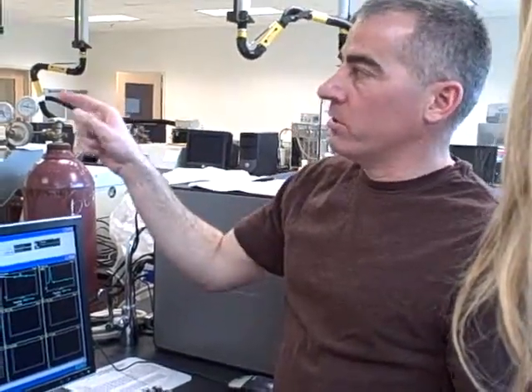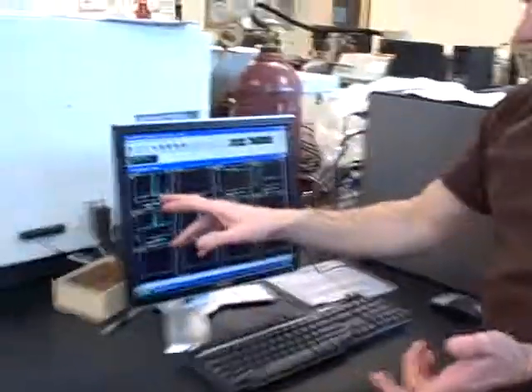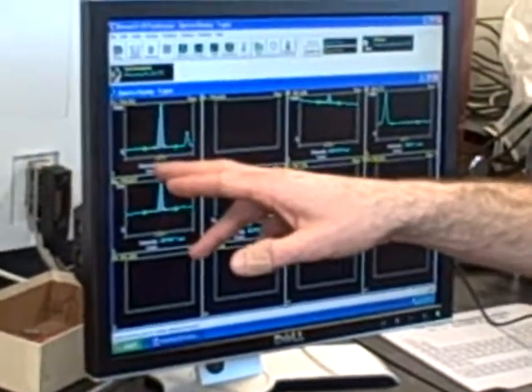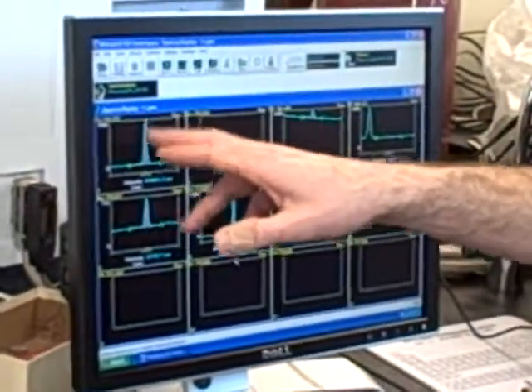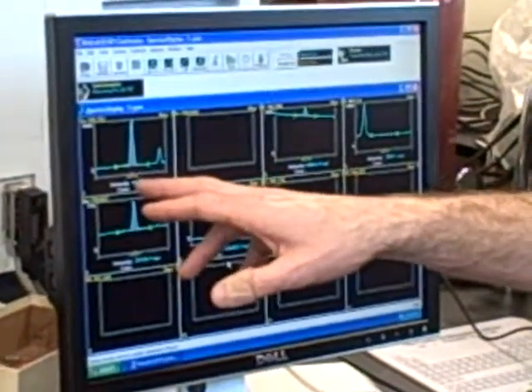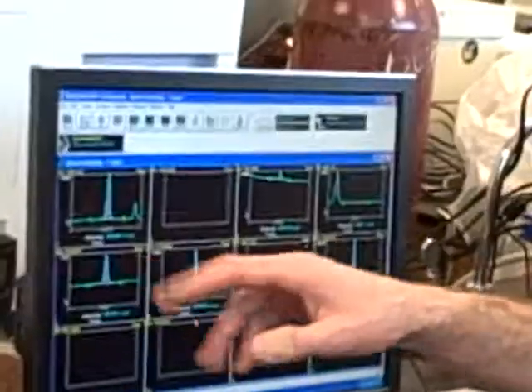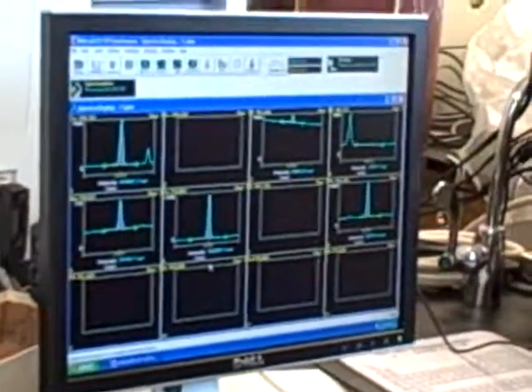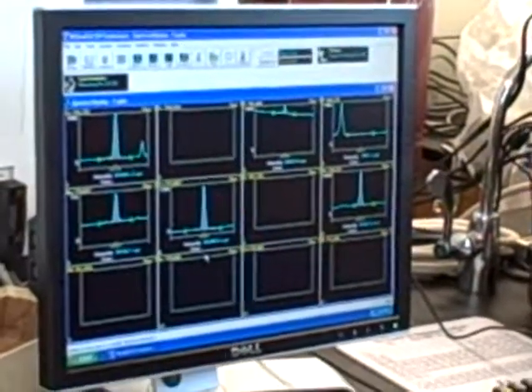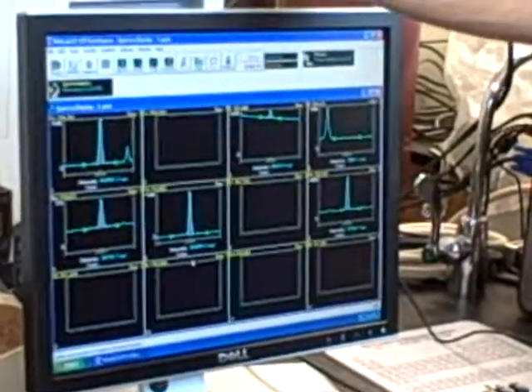The thing is, when we do elemental analysis like this, we get what we call lines. These are extremely sharp. We're looking at the wavelength in nanometers, 324.752, so that means we're going down to the thousandth of a nanometer. That's the resolution now, a thousandth. I think Scott can appreciate a thousandth of a nanometer. Yeah, that's pretty small. That's the resolution our spectrometer has here.